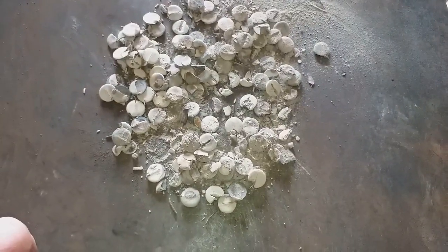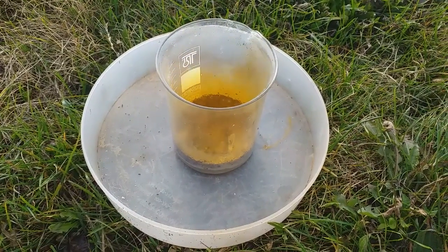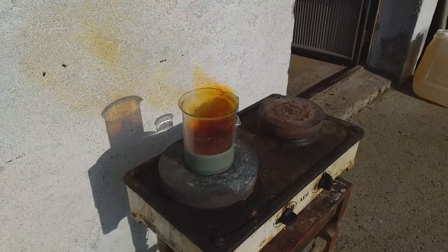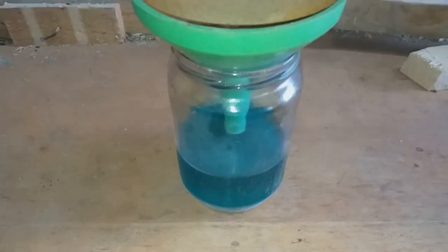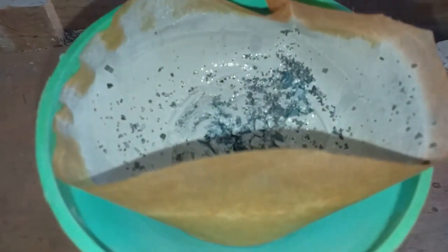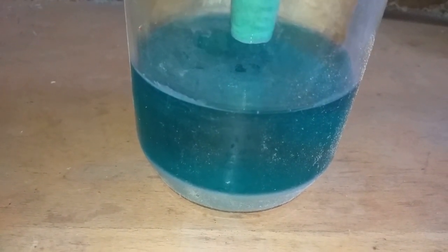I crushed that, put it in a beaker and added some nitric acid. After filtration - I left it for two days and washed the filter a couple of times - this is the slug from the capacitors, and this is the solution. Some dirty material went through the filter, but the upper part of the solution is clear, so I will decant that with the hose, just the clear solution.